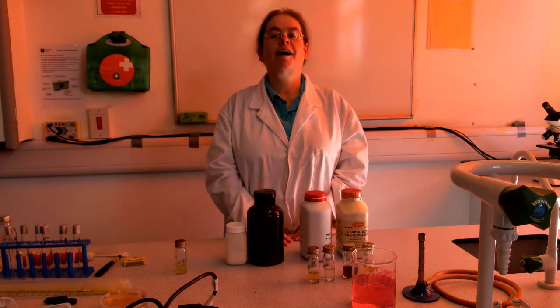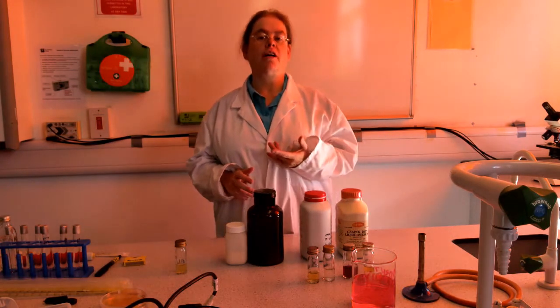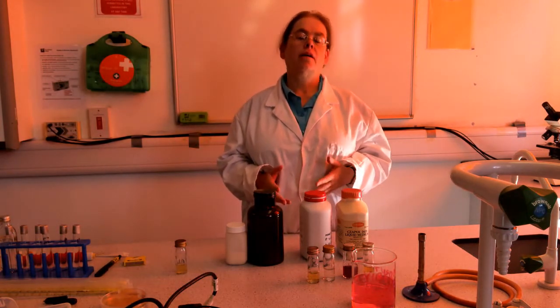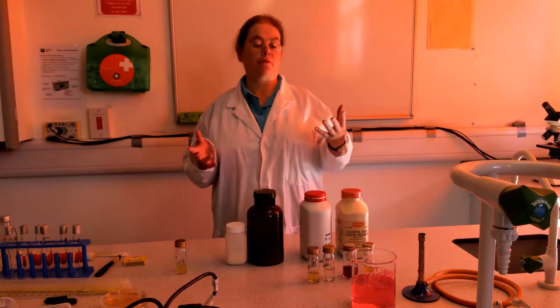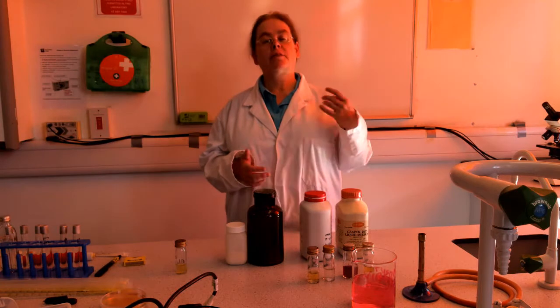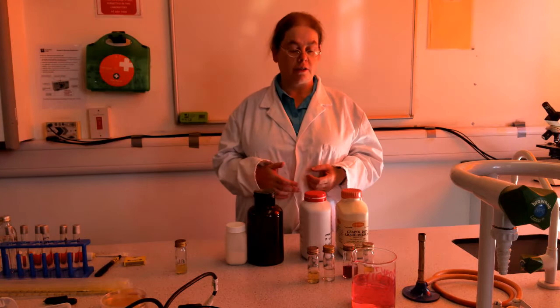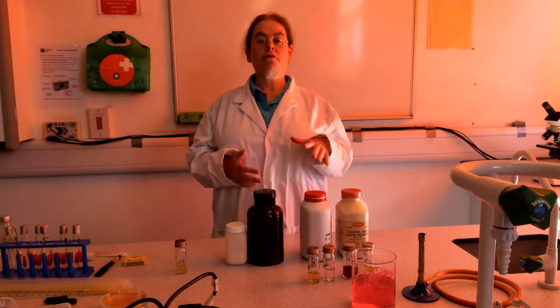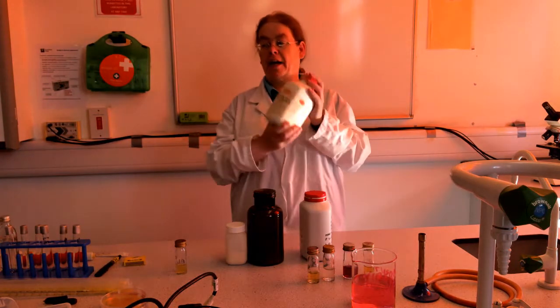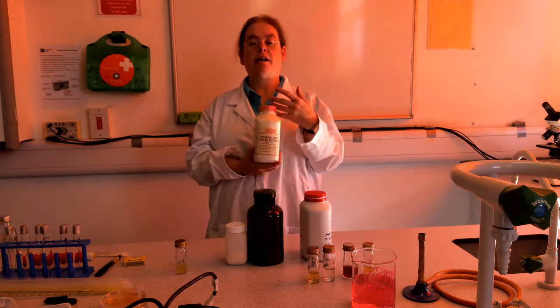Hello. Right, so the next practical that you ought to have done if you've been able to come into college concerns growth media. The growth media, as we've said, just means food for bacteria, but it comes in different sorts and for different purposes. There's a PowerPoint on the different types of media and their different uses on the Google Classroom. Now, growth media generally come pre-prepared in powdered form, and there are different types of media for different uses.